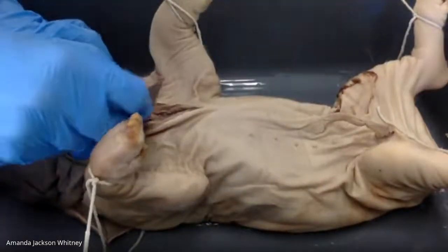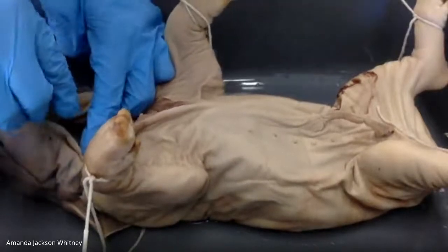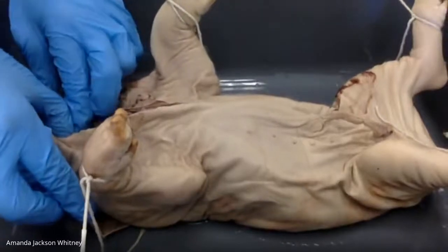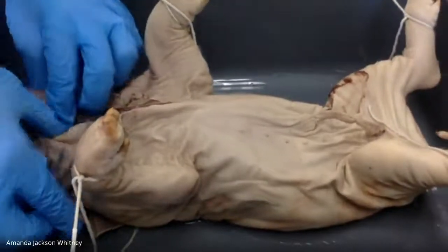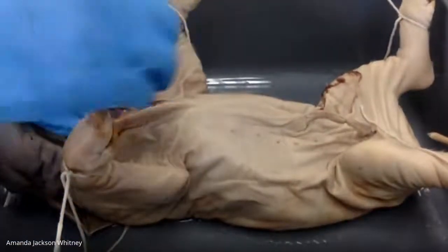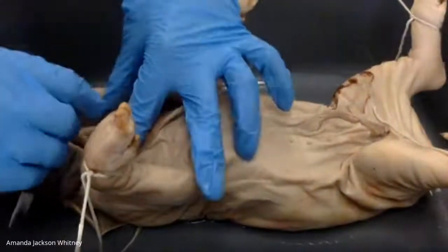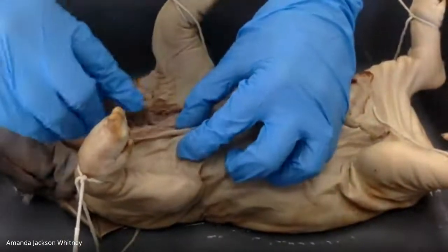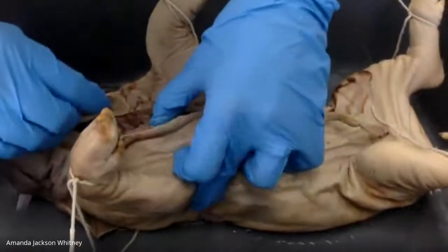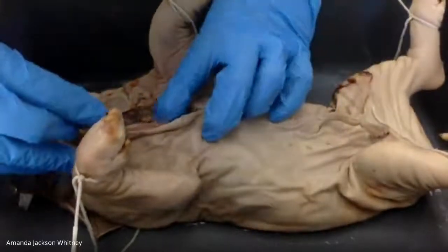That's fine. Anyone remember the name of the muscles that are surrounding our lungs?